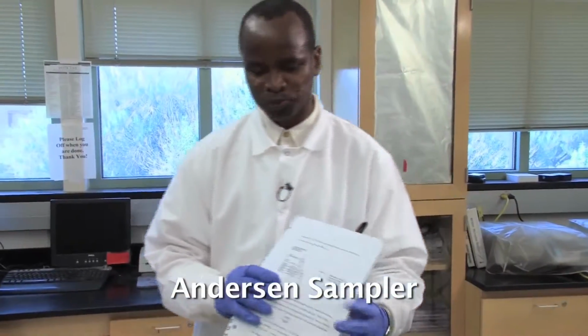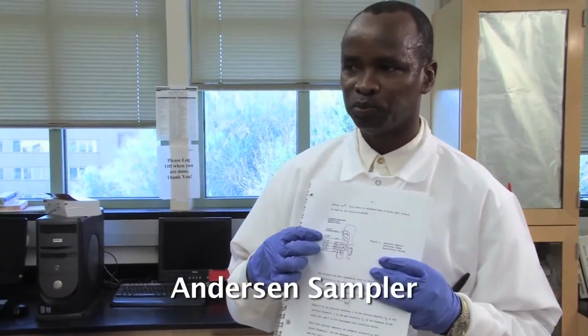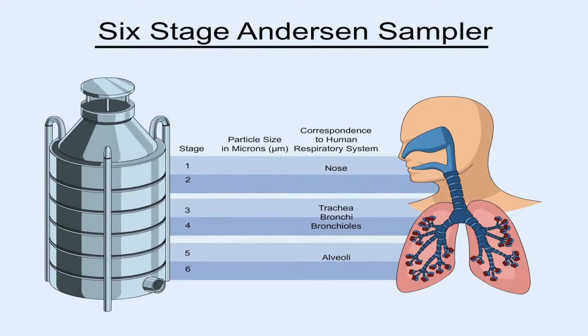So the apparatus I'm going to talk about is called Andersen sampler. And in this diagram, it's showing how this apparatus really mimics the respiratory system of human being. So it's called 6-stage Andersen sampler. And 6-stage in the sense that the particle size is cascaded in 6 different categories.